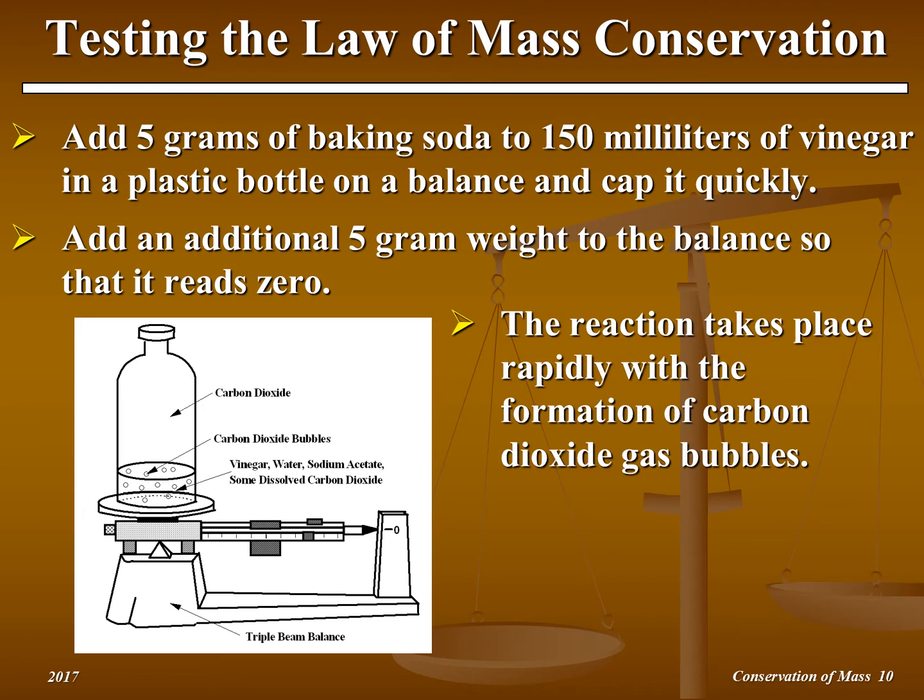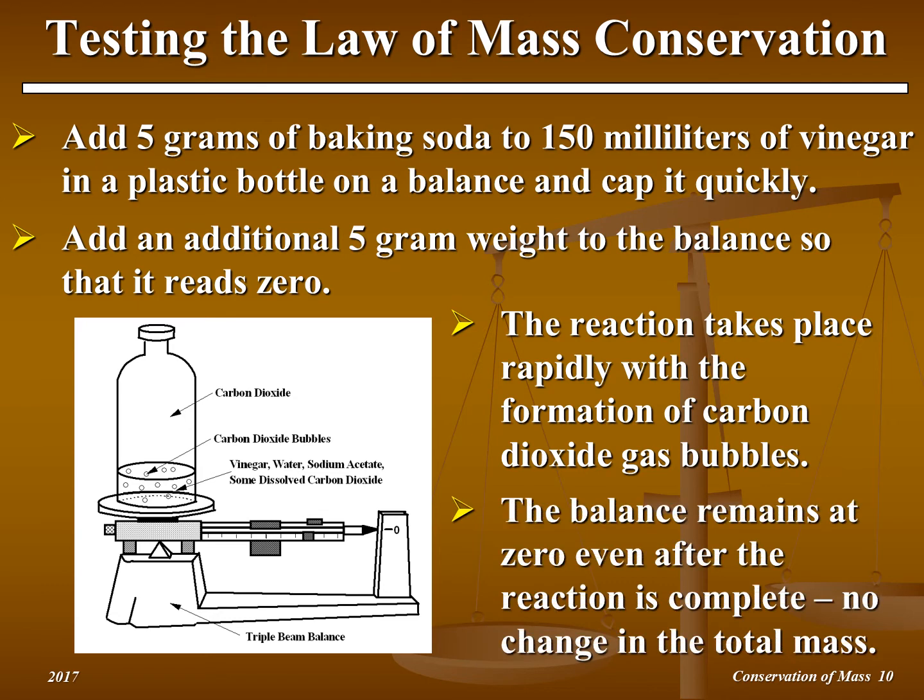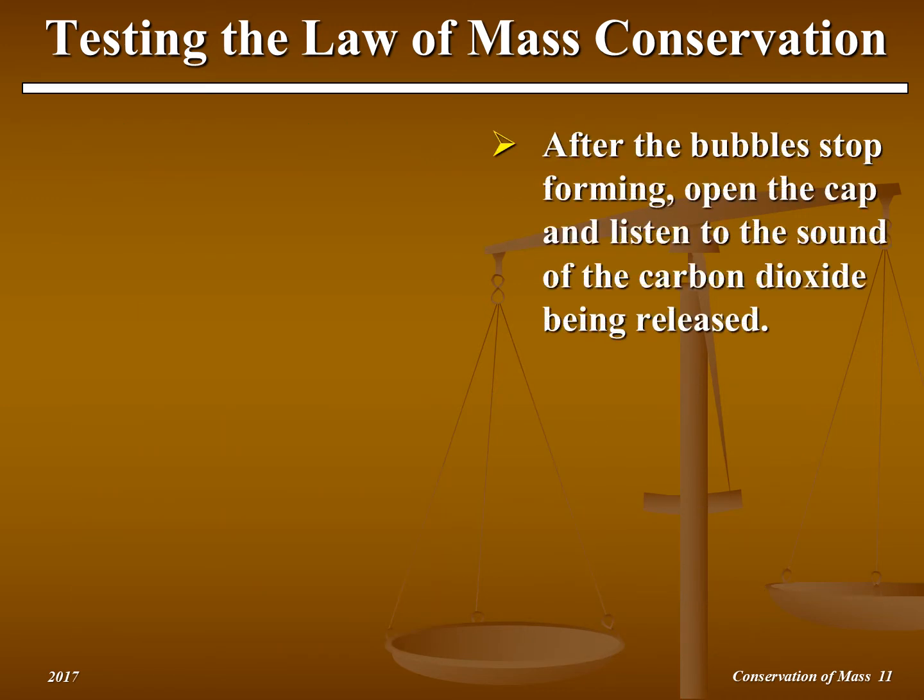Observe that the reaction takes place rapidly, with the formation of carbon dioxide gas bubbles. Note that the balance pointer remains at 0, even after the reaction is complete. Since there is no change in the total mass, the law of conservation of mass is confirmed. After the bubbles stop forming, open the cap quickly, and listen to the sound of the carbon dioxide being released.